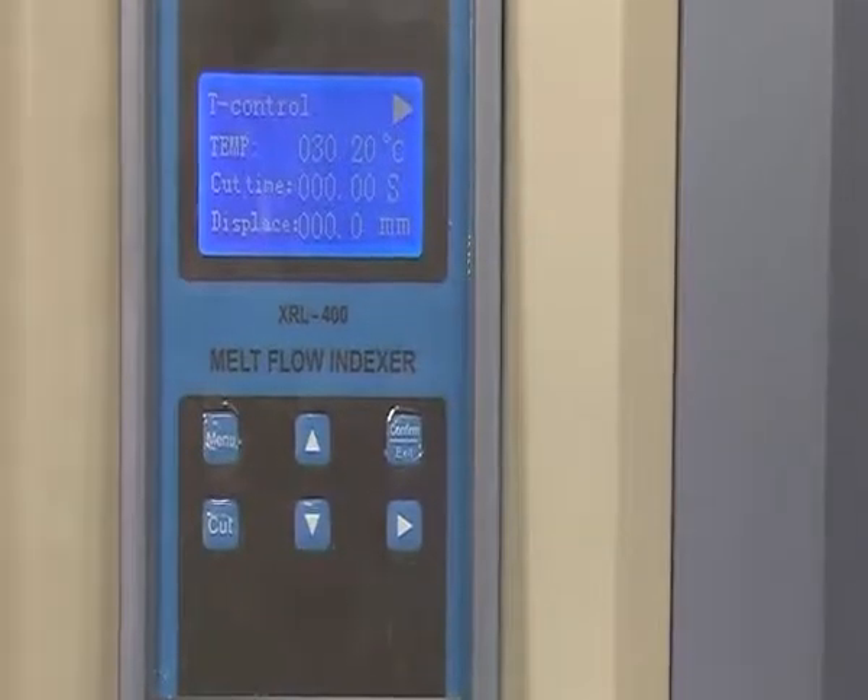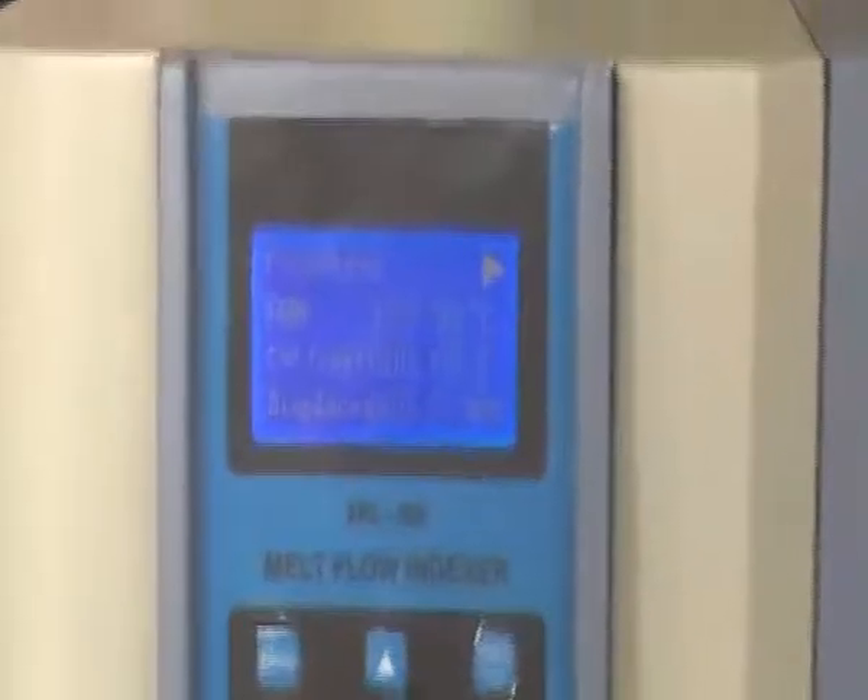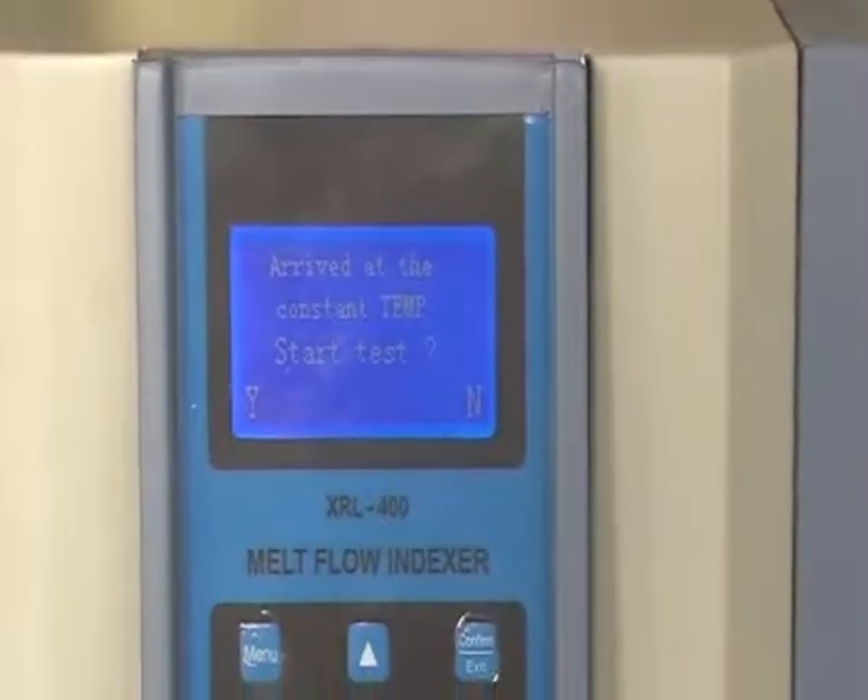You can see there is a signal on the upper right of the screen. It means the temperature is being increased.